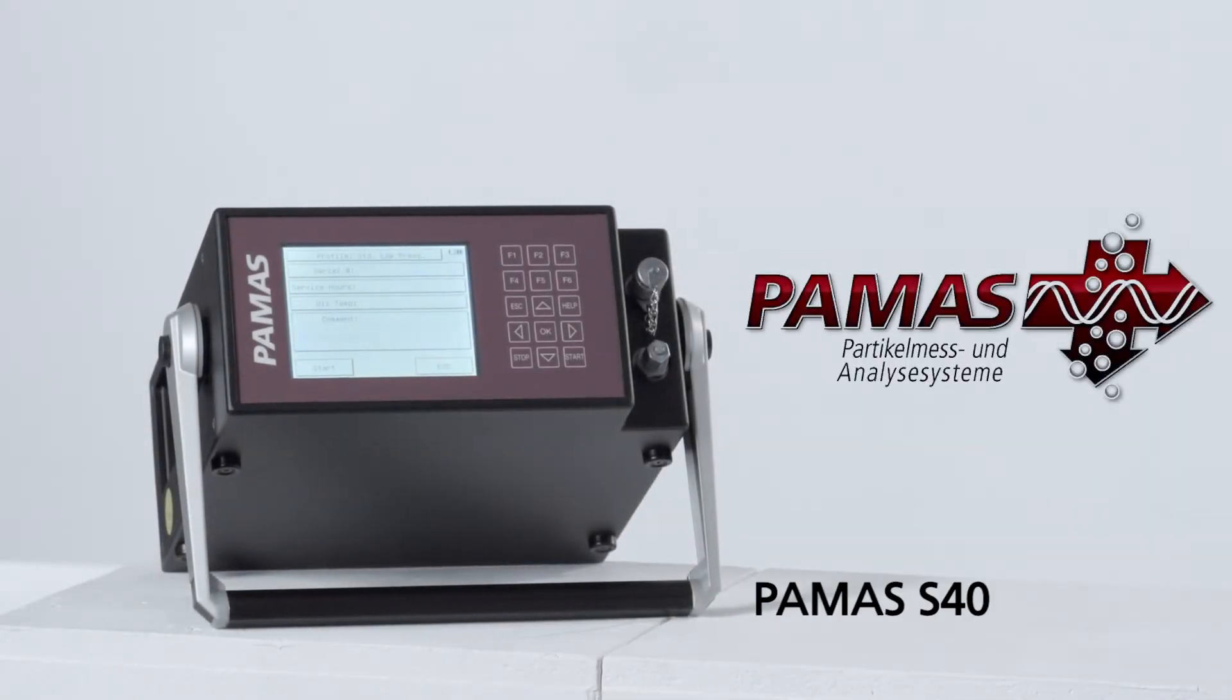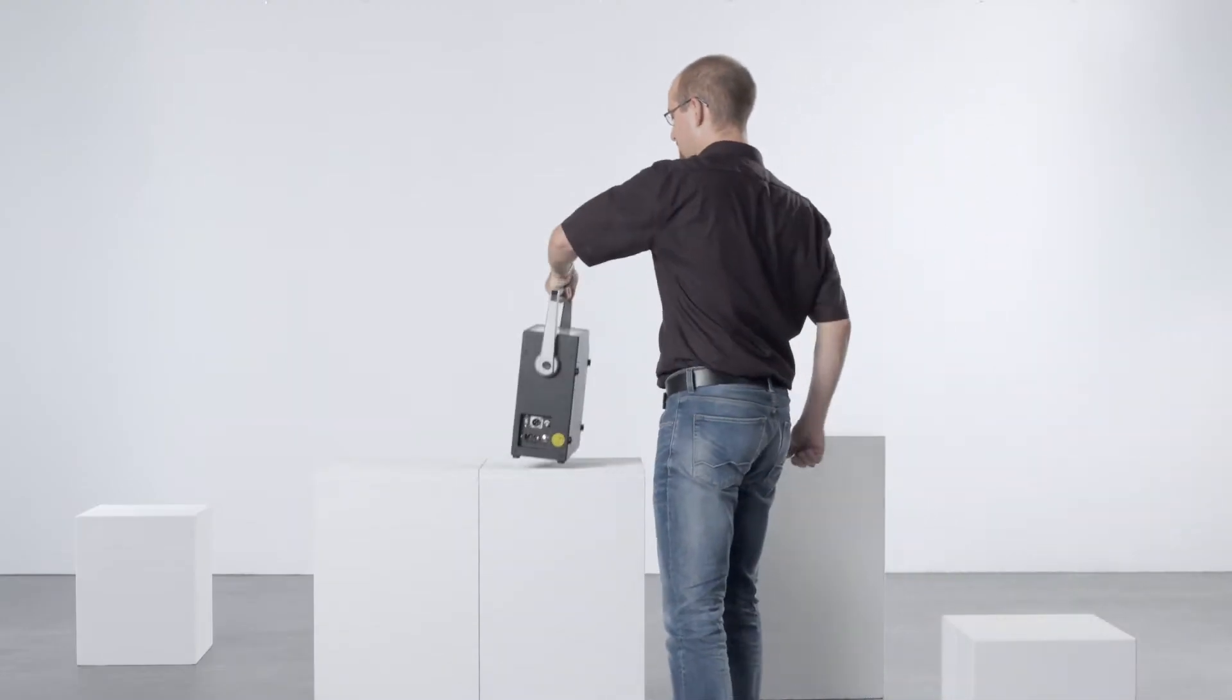The PAMAS S40 Particle Counter, a portable particle counter available for various applications and fluids.